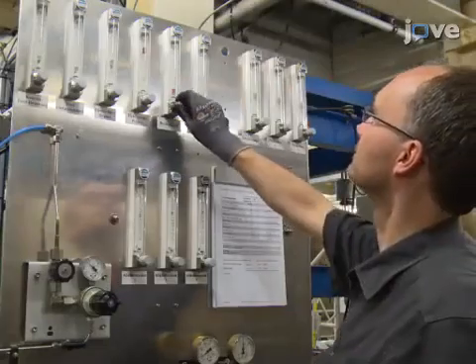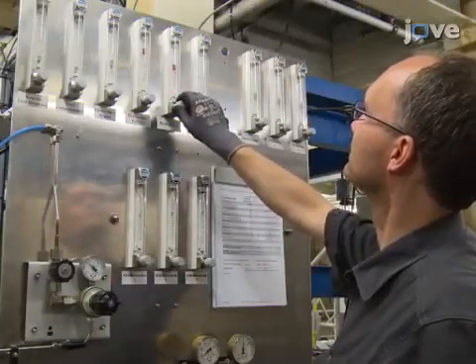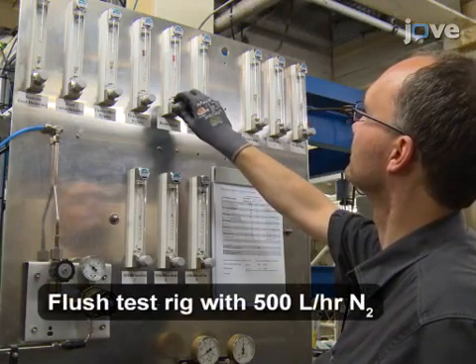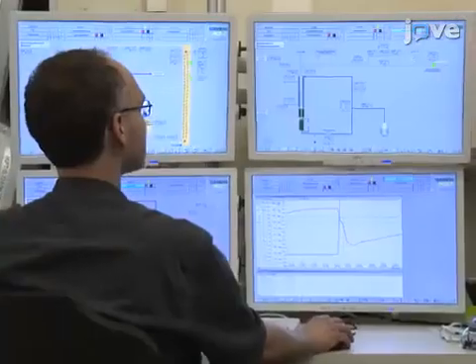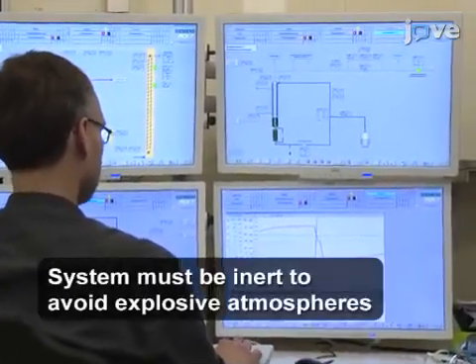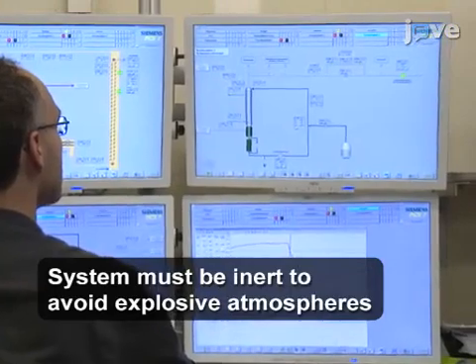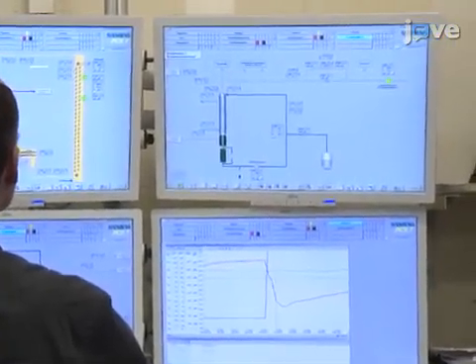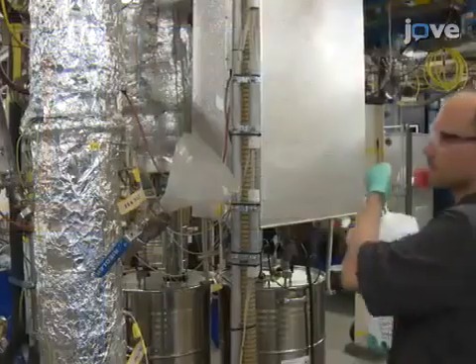To begin this procedure, activate the pyrolysis and condensation system by starting the auxiliary nitrogen supply and the pyrolysis gas fan. Then regulate the fan by opening the fan's menu in the process control and adjusting its nominal volumetric flow such that the pressure in the reactor is 3 to 8 millibars above ambient pressure.